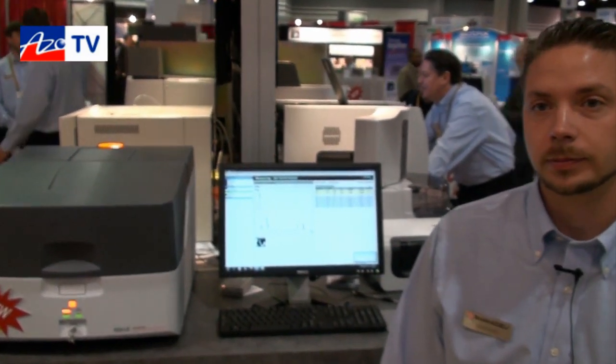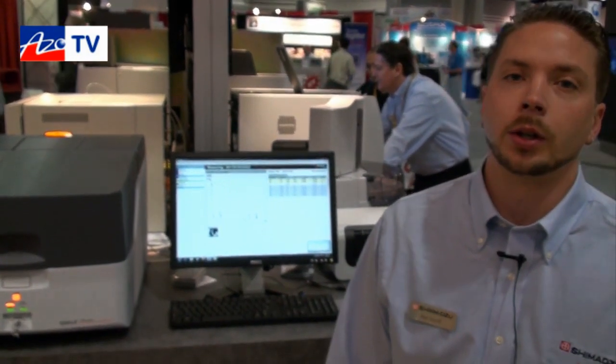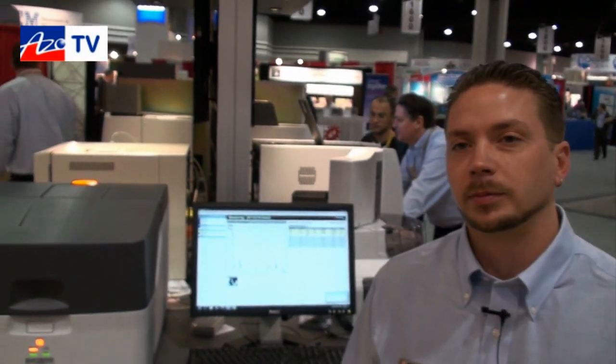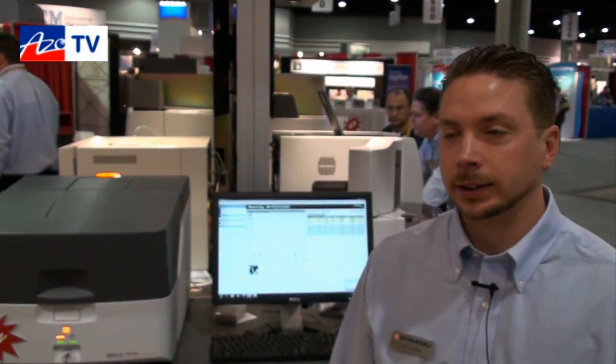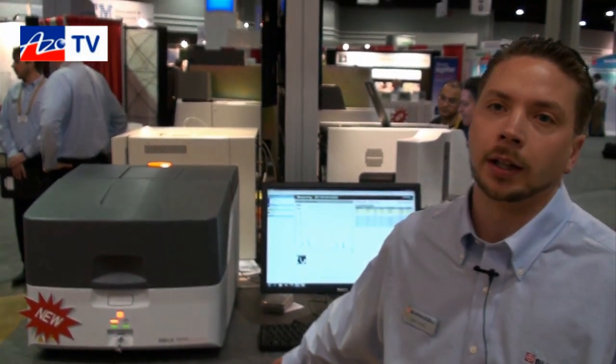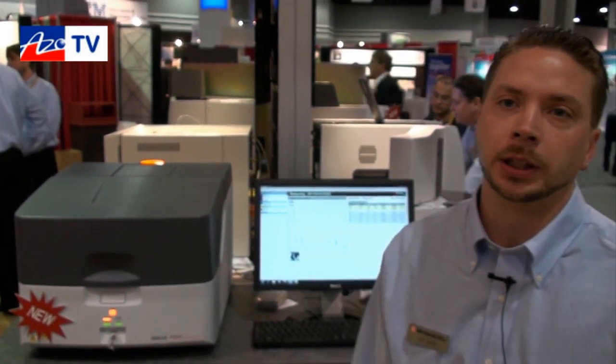And what's a typical cycle time to produce results? It's on the order of two to three minutes — it's pretty fast. And the compact benchtop size makes it a popular instrument in the industry. Yes, it can be placed on the bench, or wherever it needs to be, or in the warehouse or factory floor for the analysis of RoHS materials.